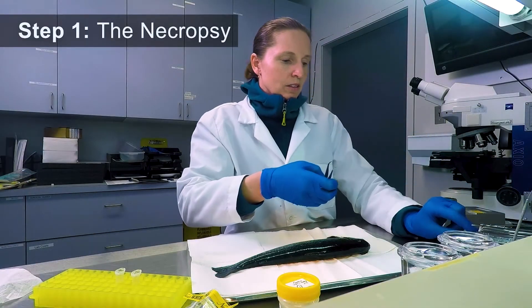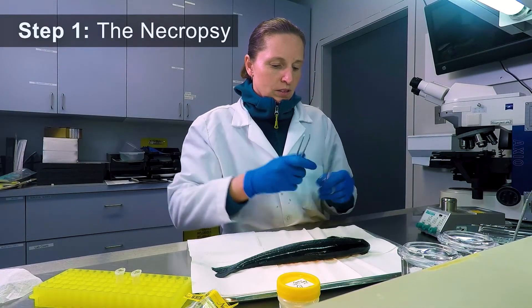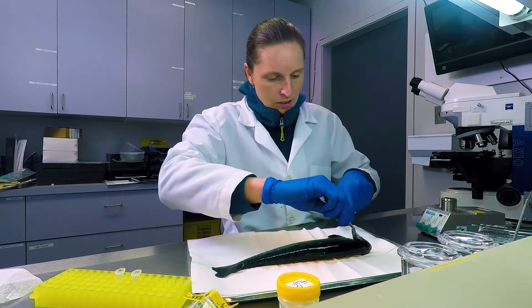In the necropsy lab, samples are being taken from a fish to be tested for pathogens and viruses of concern.